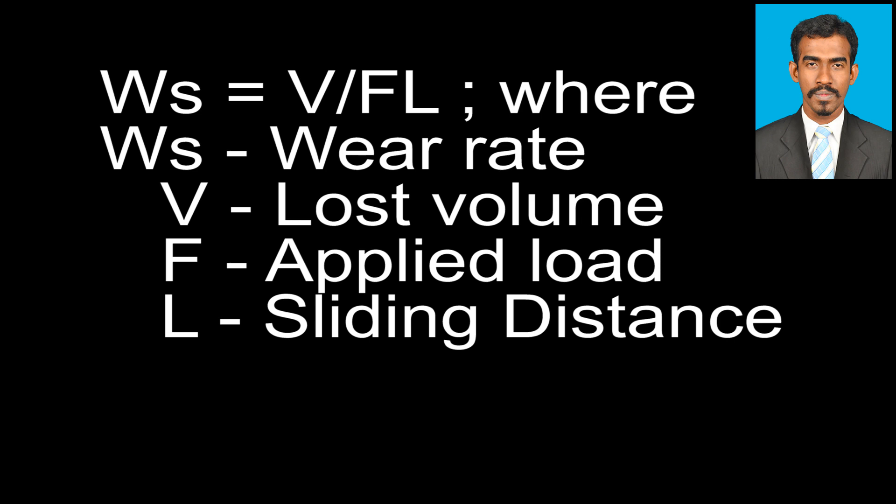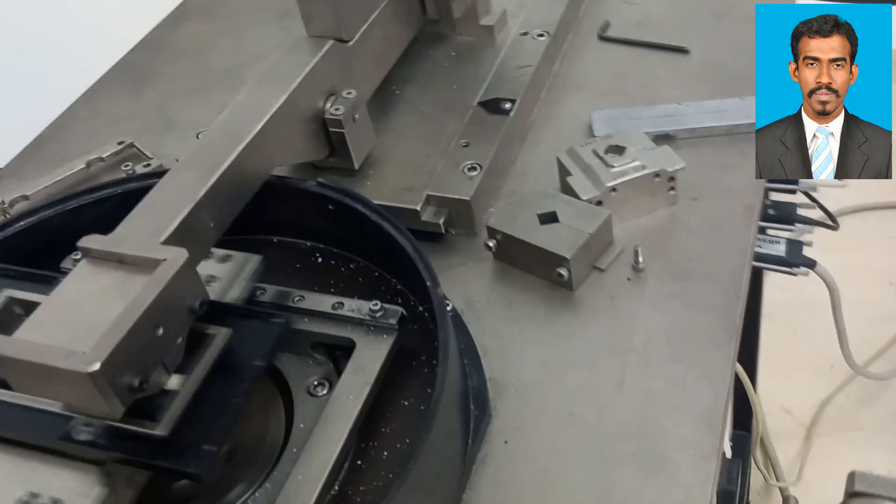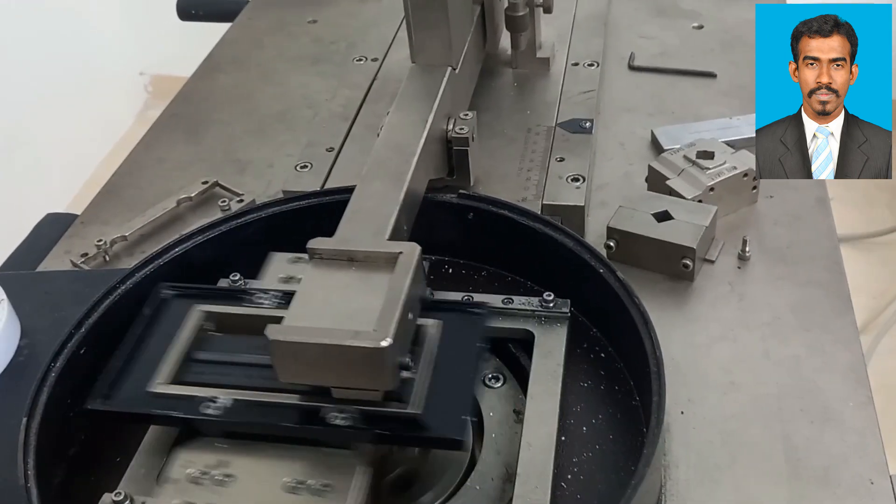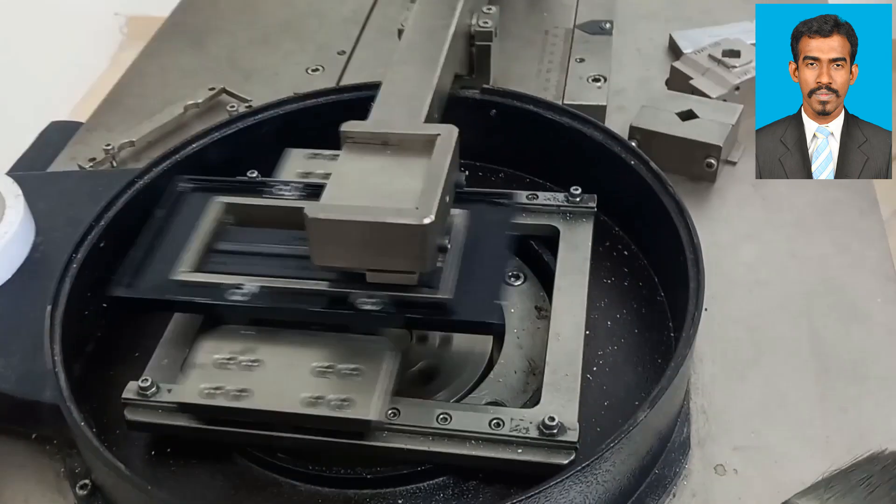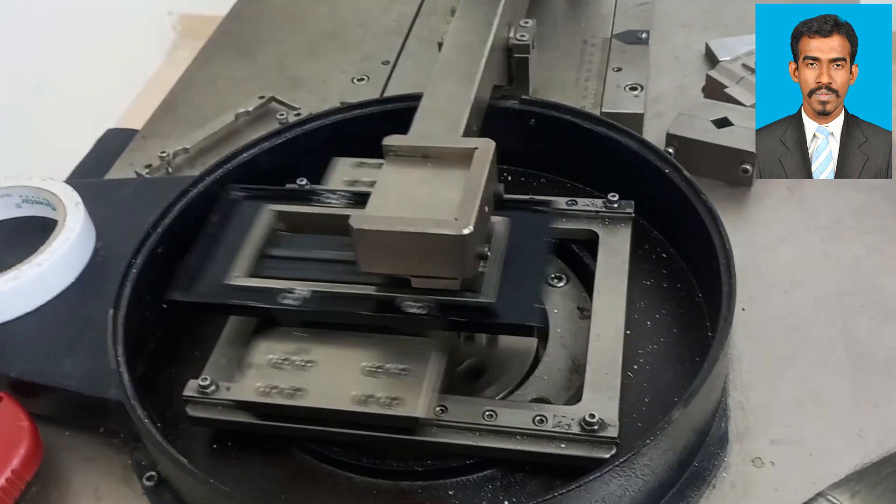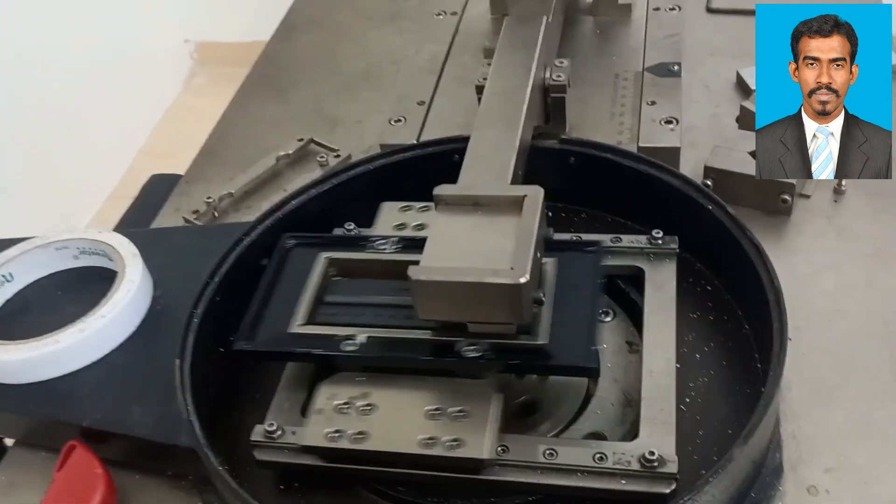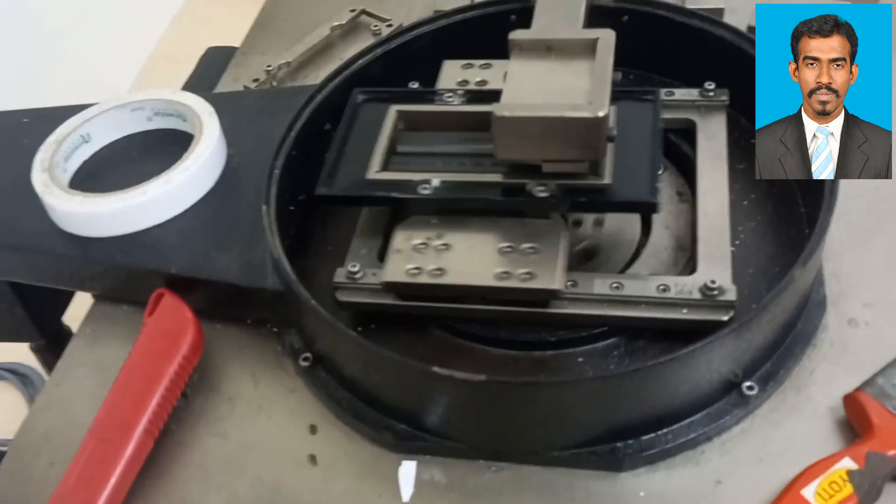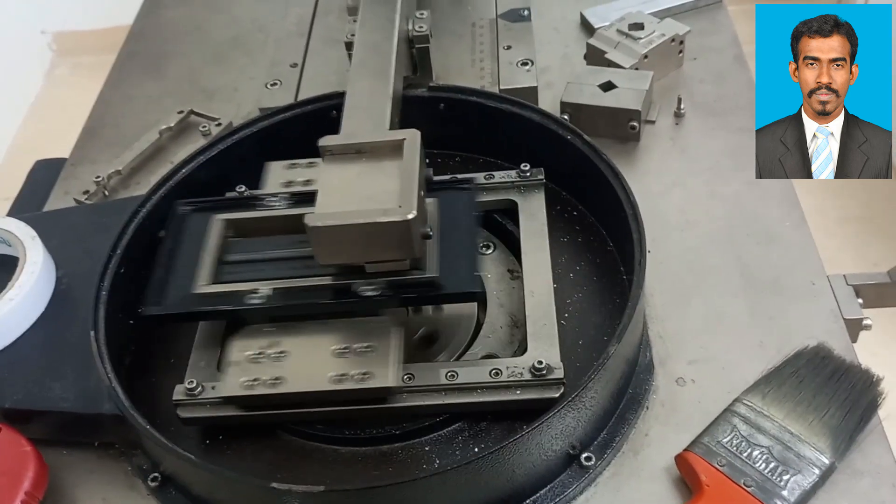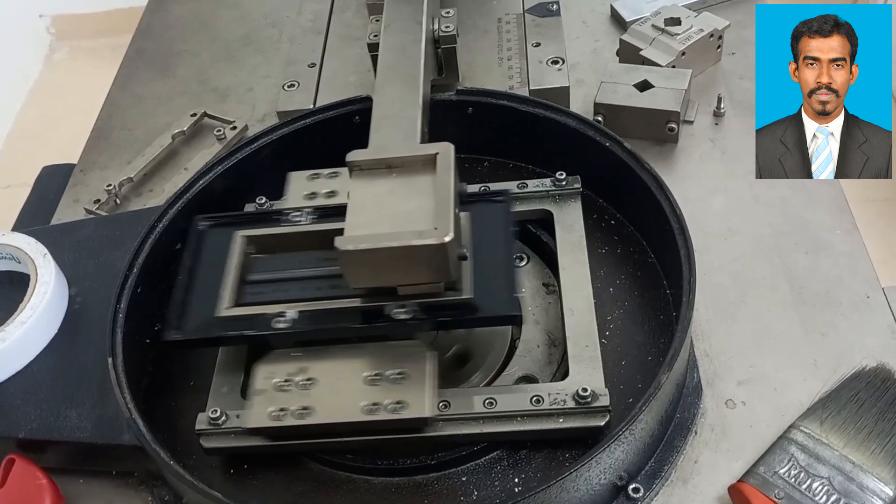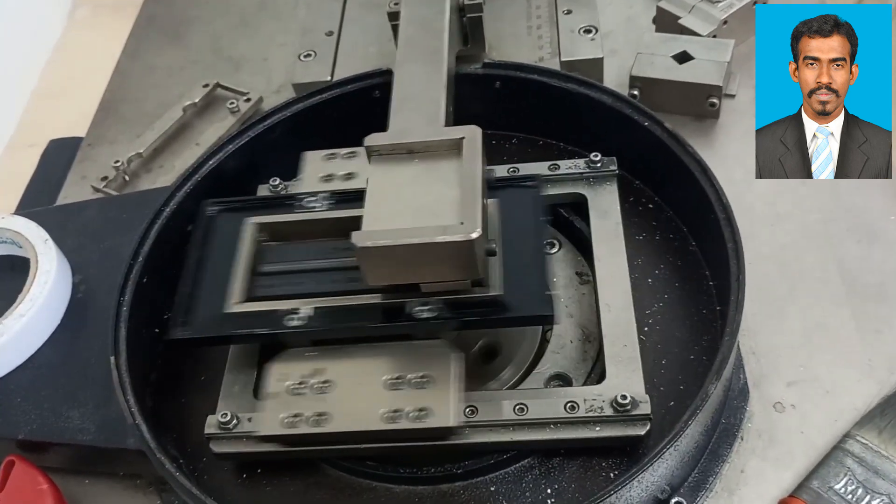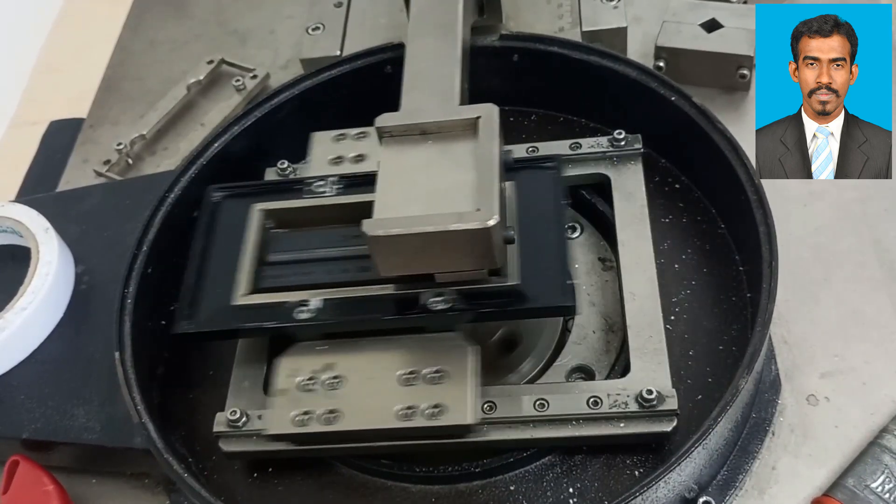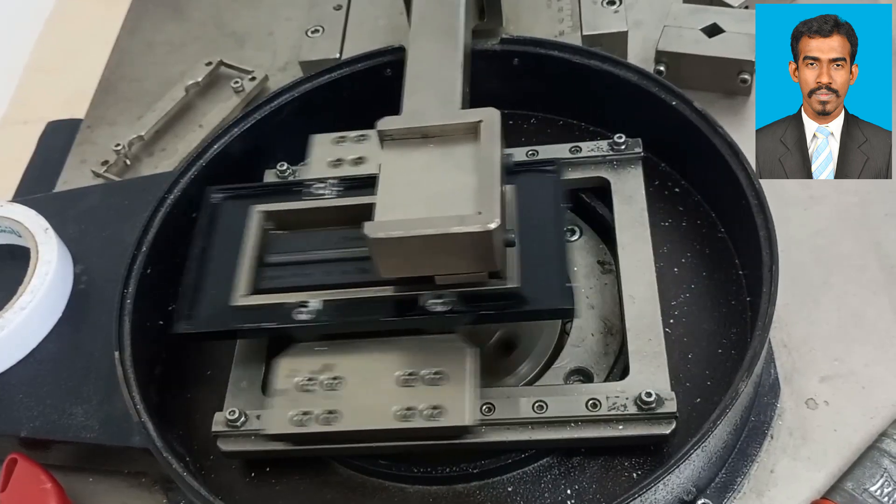If you observe closely, you can see there's a vibration - the arm itself is moving. Under such circumstances, the force value you obtain in the graph would be higher than the normal load you provided. By cross-checking this, you can check whether the experiment is running smoothly or not. In case there is extra vibration, you definitely need to stop the experiment and set the parameters and the machine again, then run again, because the results which we are obtaining would be wrong.